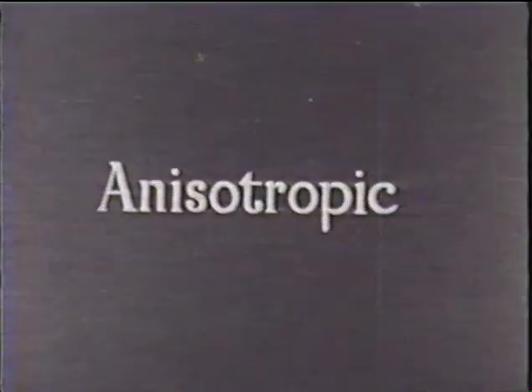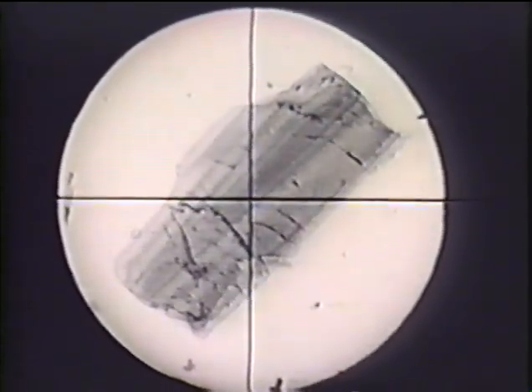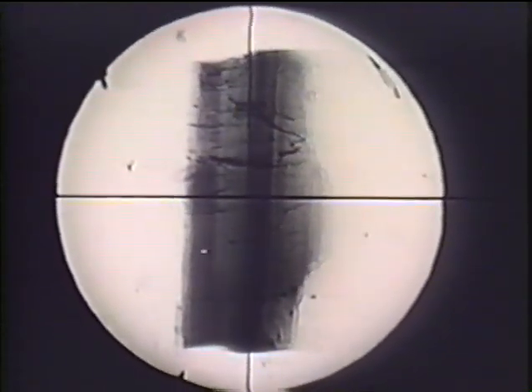Now we'll test some anisotropic fragments in the same way. This is a prismatic crystal of the anisotropic mineral tourmaline. When it's pointing east-west the polarized light is vibrating parallel to the prism. The crystal appears transparent. When it's turned north-south the light is vibrating at right angles to the prism. The crystal is now nearly opaque.